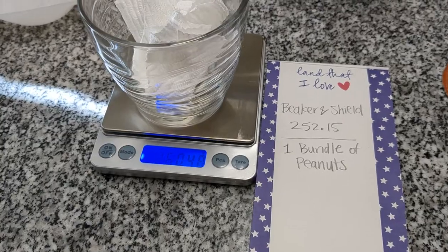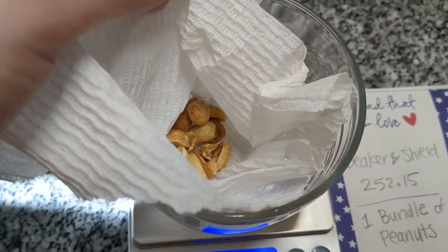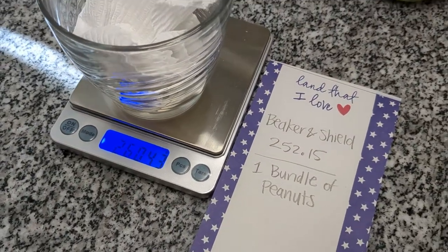If you use beakers or plastic shopping bags or whatever, you have to tell the kids the mass of that thing so that they don't have to handle it. What's going to happen is you would label this one bundle of peanuts, so they'll do some math and know that there's eight peanuts in this jar — then tell them the mass of the beaker. They count how many are in there by weighing it. You can do this in any quantity of bundles, whole numbers or even decimals. So like five and a half bundles of peanuts — five and a half times eight would give us 44 peanuts.